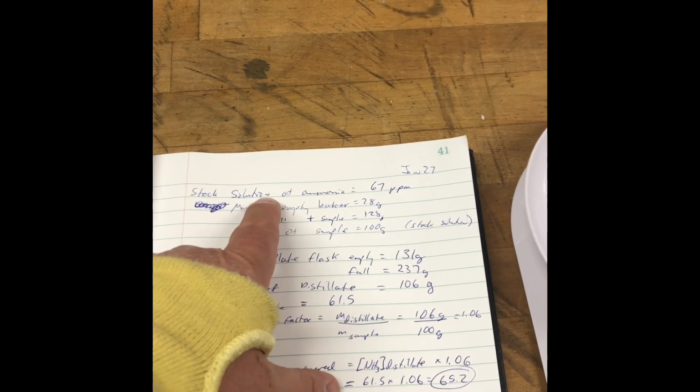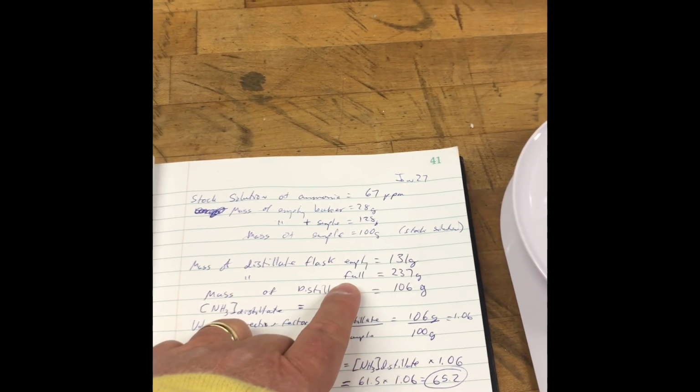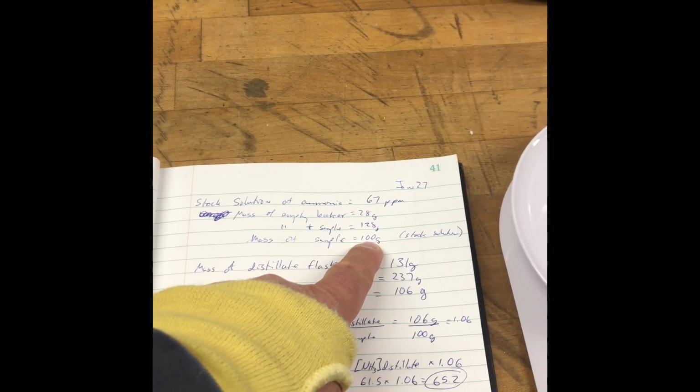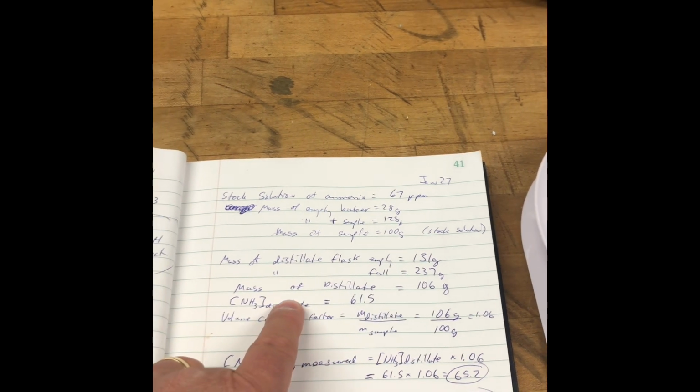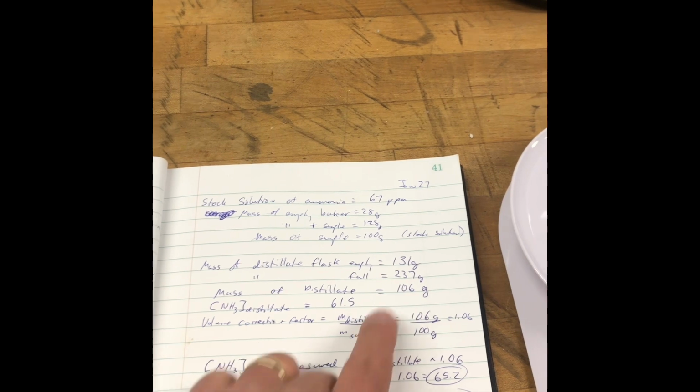So I've got a known stock solution I measured before I started is 67 ppm. I measured the mass of sample that I used to distill, which was 100 grams, and I measured the mass of distillate collected, which was 106 grams.